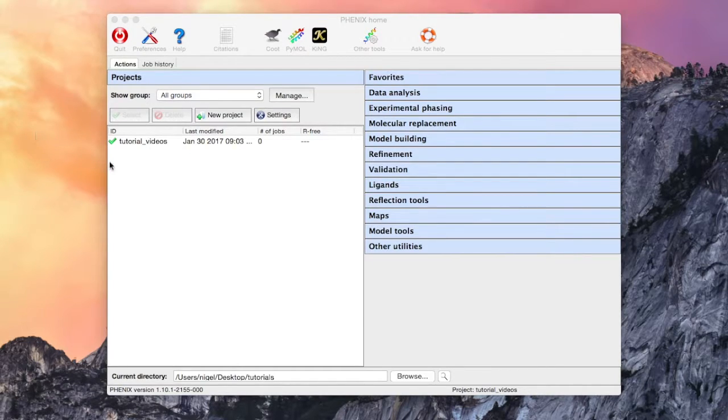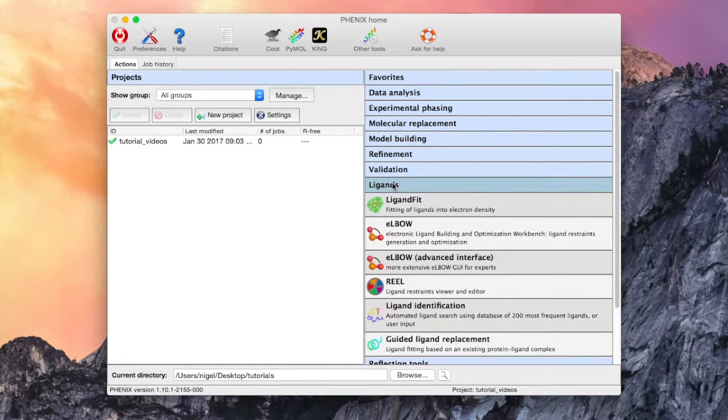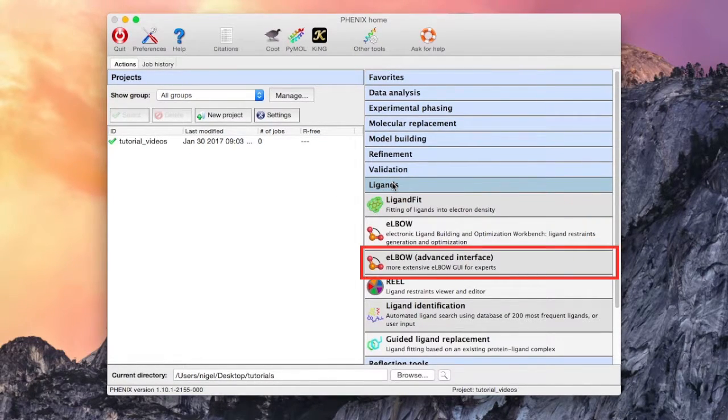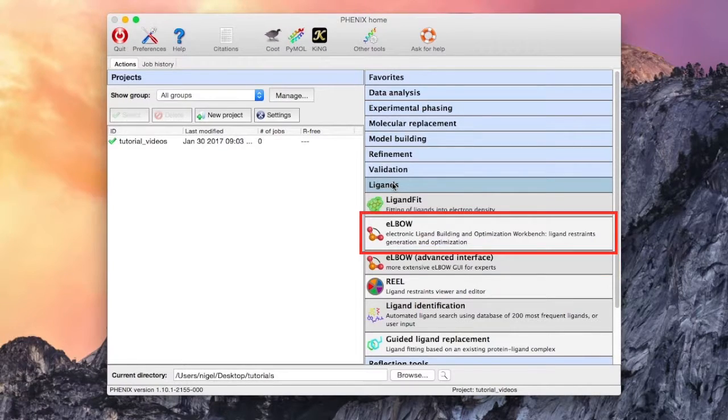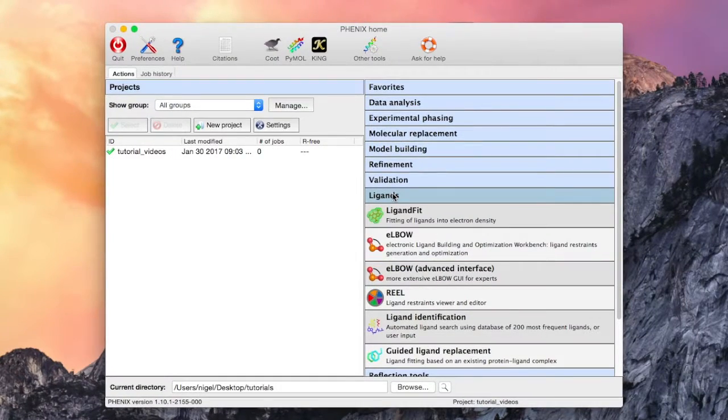The Phenix GUI has two elbow GUIs, both in the ligands button of the main menu. One is for the advanced user, but this tutorial is going to introduce the simplified wizard elbow GUI.